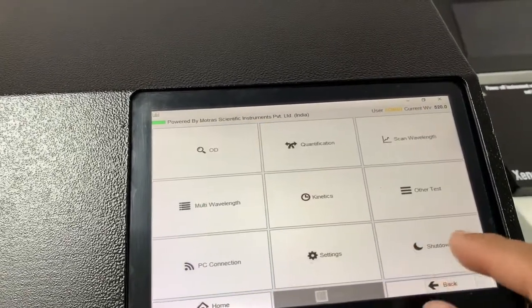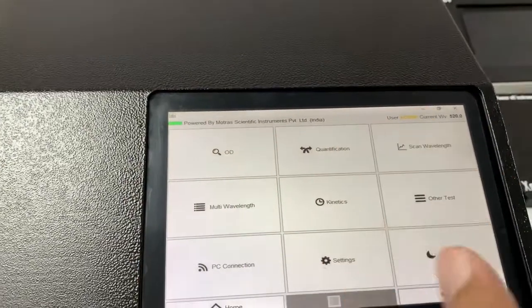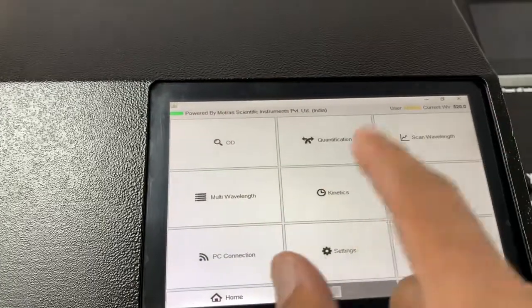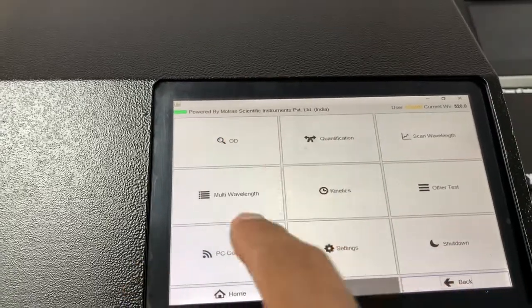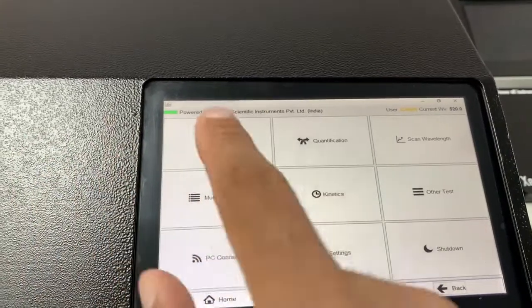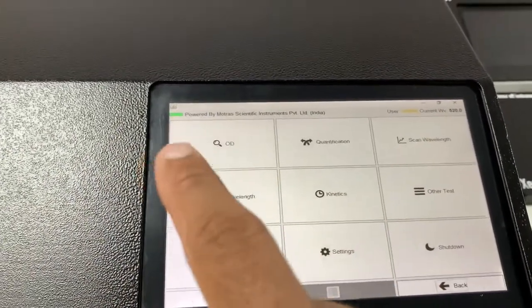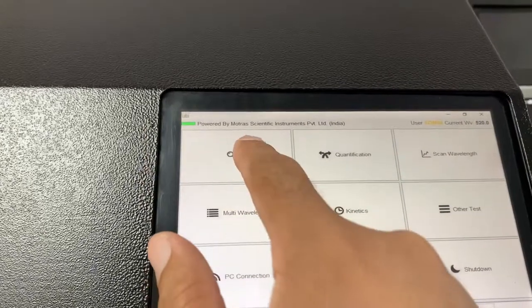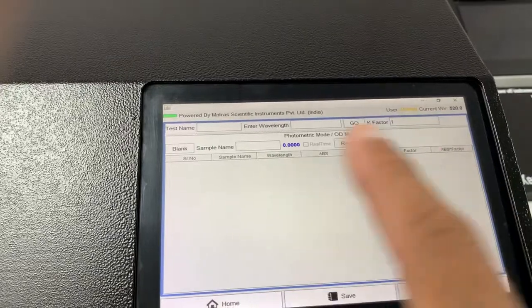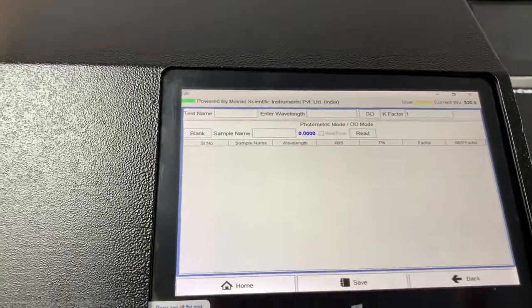And then we have the shutdown. The screen layout is similar on the desktop — you don't get these buttons; these options appear in the file menu, such as File > New OD or File > New Quantification. After loading that screen, you will see a similar screen on the desktop as well. The learning curve is almost zero — you don't need to learn two different softwares.